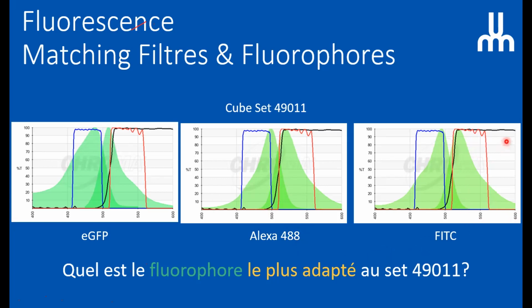That's totally right. But does it mean that FITC is the best for my experiment? Well, we also have to look at the absorption coefficient and the efficiency. So in total, this doesn't tell you the full answer, but the answer to this question is that FITC is the best matching fluorophore for the filter. Actually, it's the opposite: the filter was made for FITC, so they designed it the other way around.